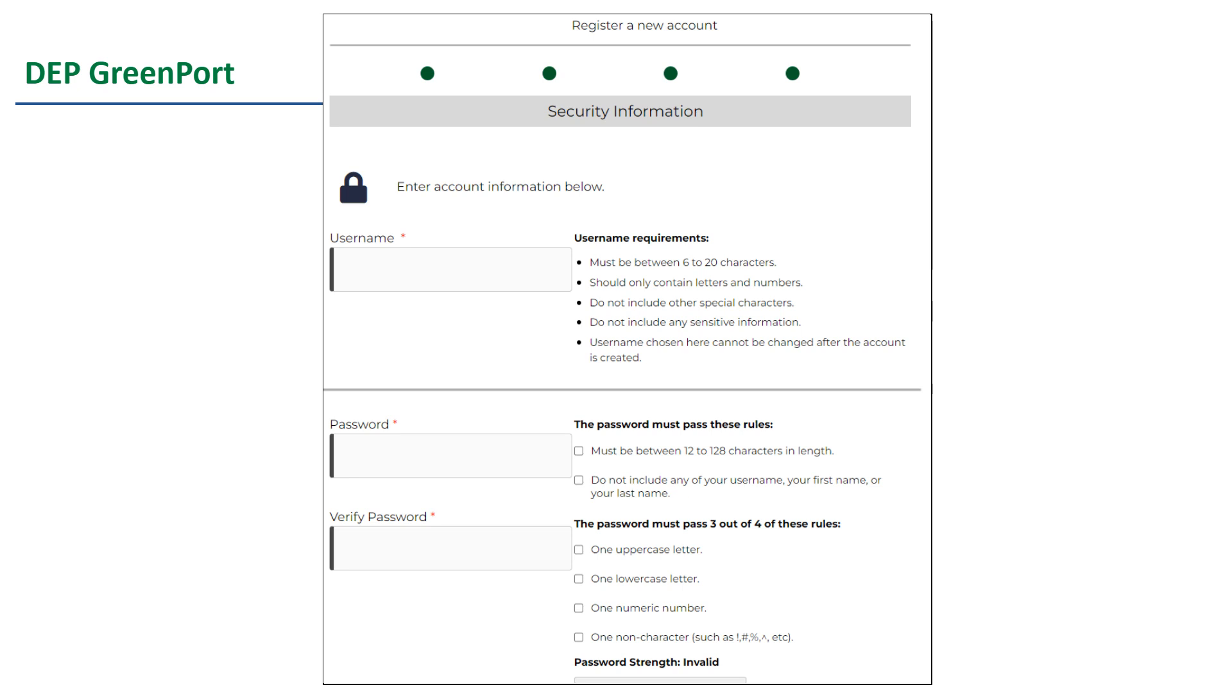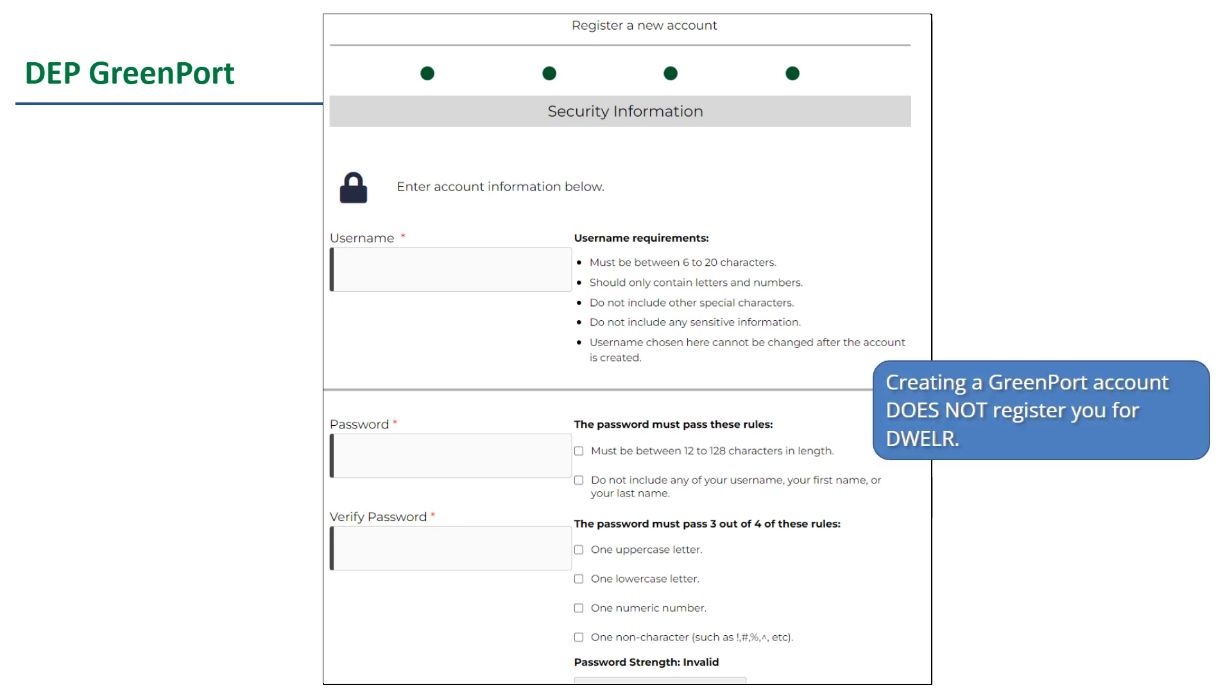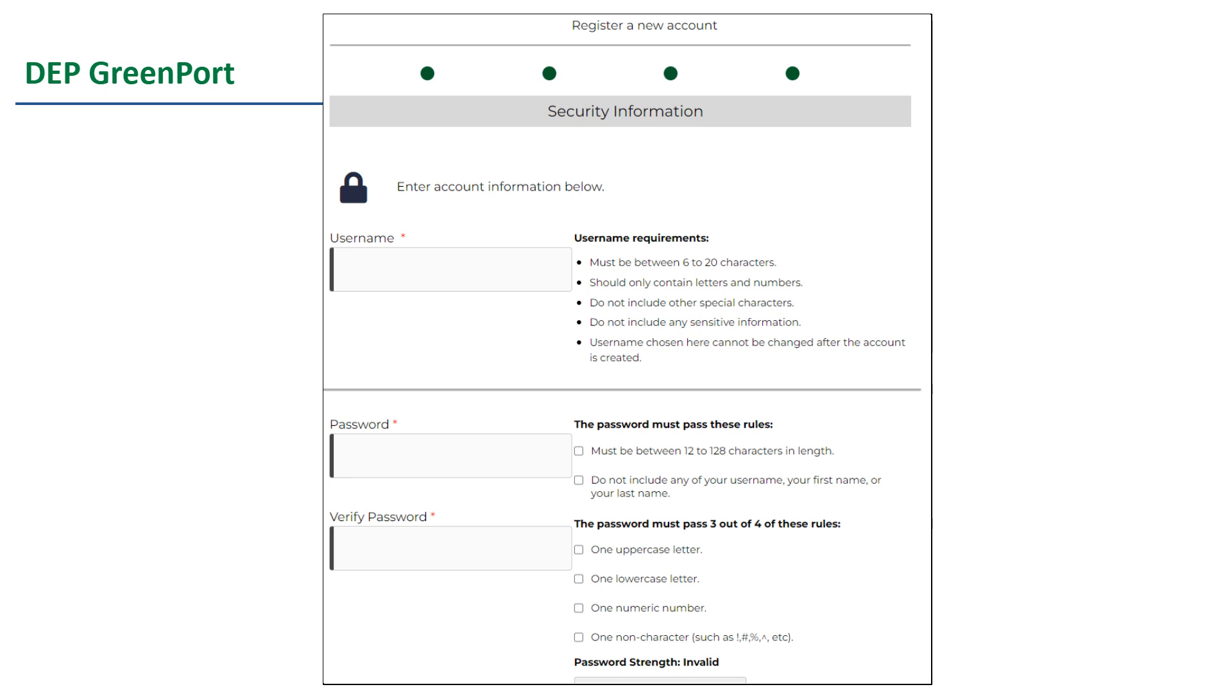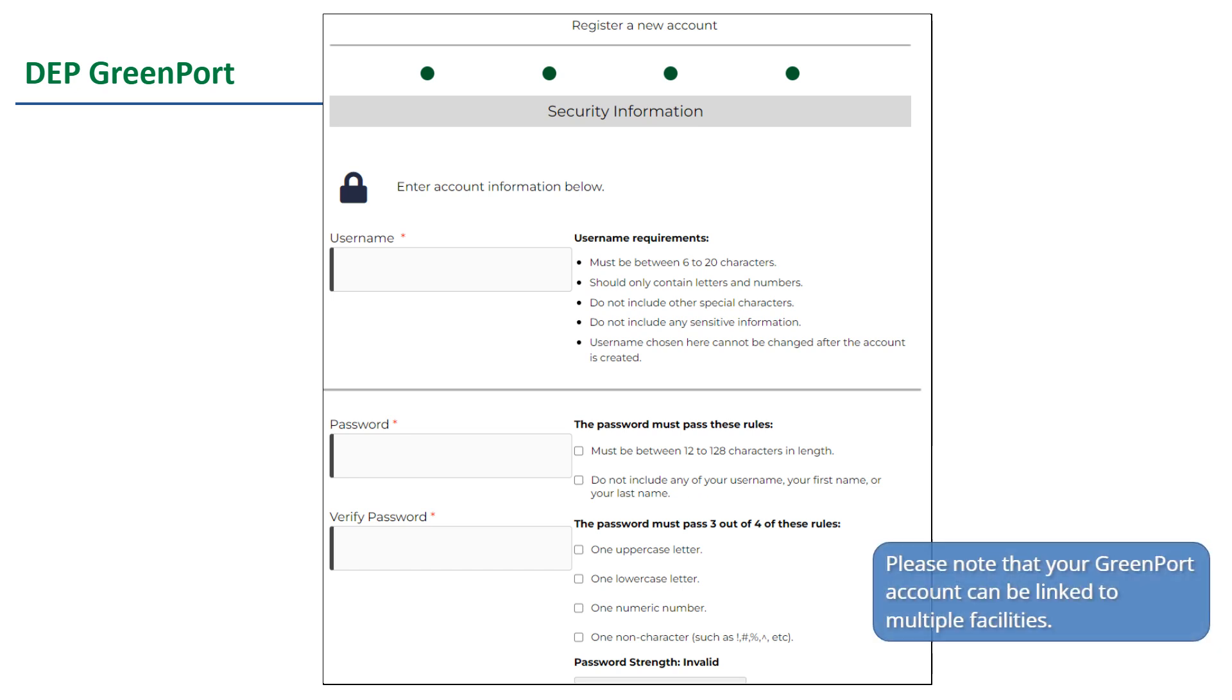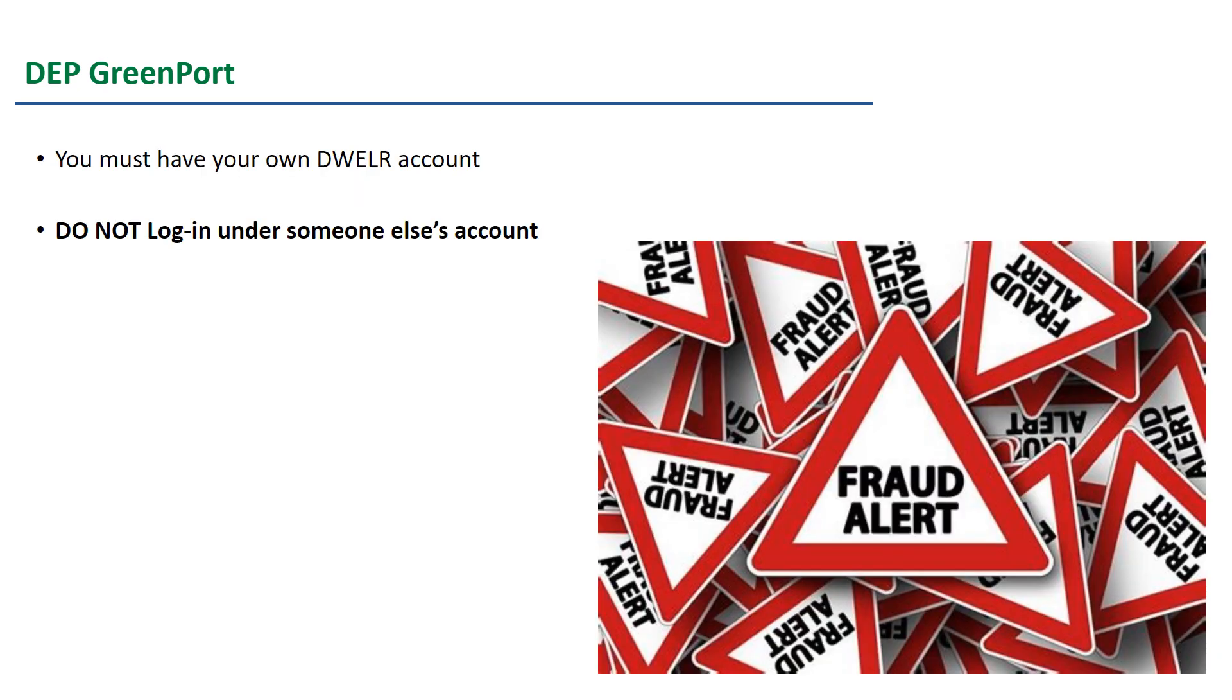Your GreenPort username will be the same username for your DWELR account. You need to do this step before DEP can process your DWELR registration form, which we will get to later in this video. A lot of systems think that creating a GreenPort account is all that they need to do to register for DWELR, but it is not. All this step does is create a user account for you in GreenPort. Your account then needs to be linked to a facility. Your GreenPort account can be linked to multiple facilities. Everyone who uses DWELR must have their own account. Do not log in under someone else's account. It is considered fraud to submit reports in someone else's name.